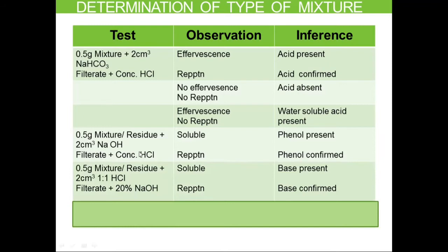We move on to test 3. The residue is washed only with water since no phenol is present. The washed residue is then treated with 1:1 HCl, shaken well, filtered, and to the filtrate we add 20% NaOH. Again, there is no reprecipitation observed. Hence, a base would be absent. We confirm the filtrate is alkaline by placing a drop on red litmus — it turns blue — but still no reprecipitation, confirming base is absent.